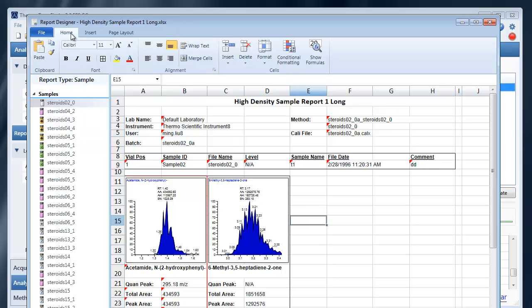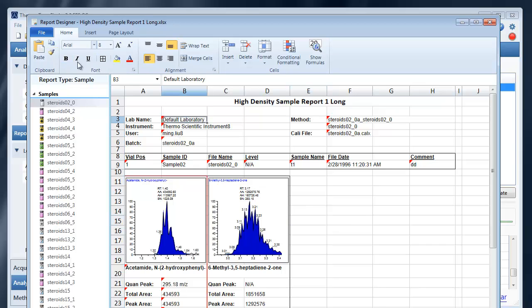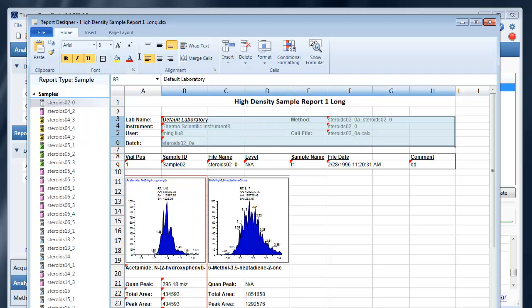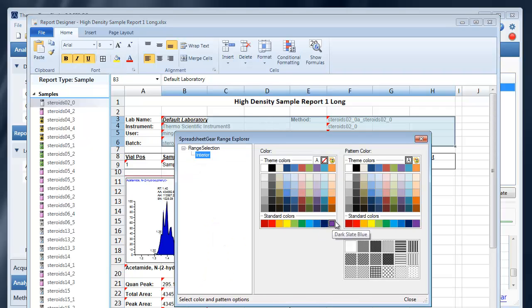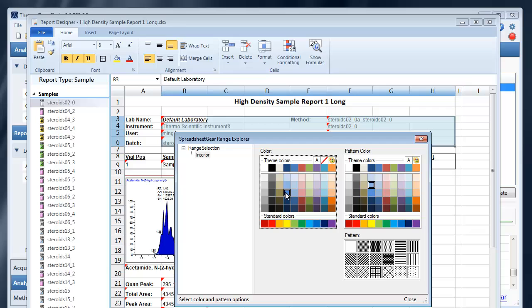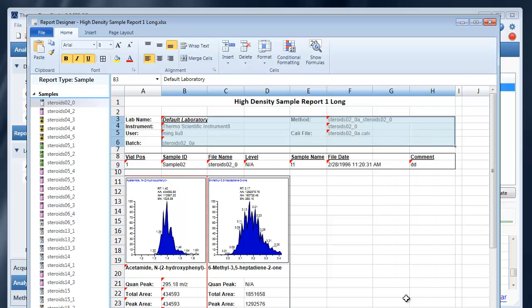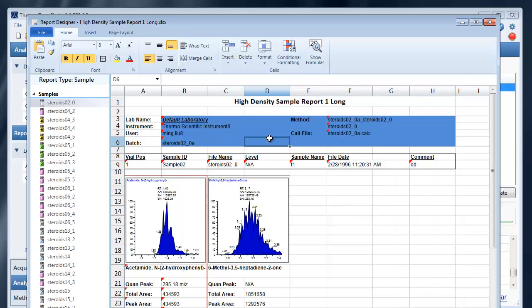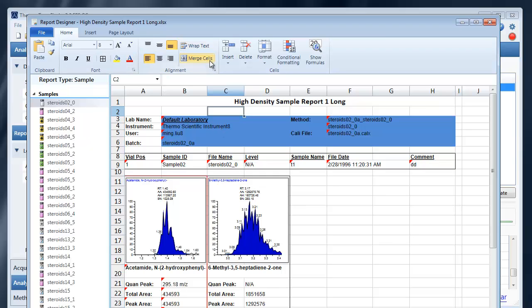Next you'll see the home tab where you have the typical Excel formatting functions which will allow you to bold, italic, underline the selected cells. You can do most of the things you can do in Excel as far as formatting goes, including merging cells, wrapping text, setting alignment.